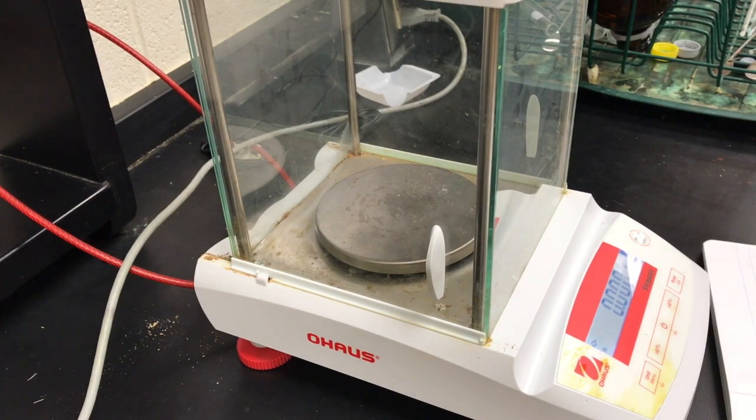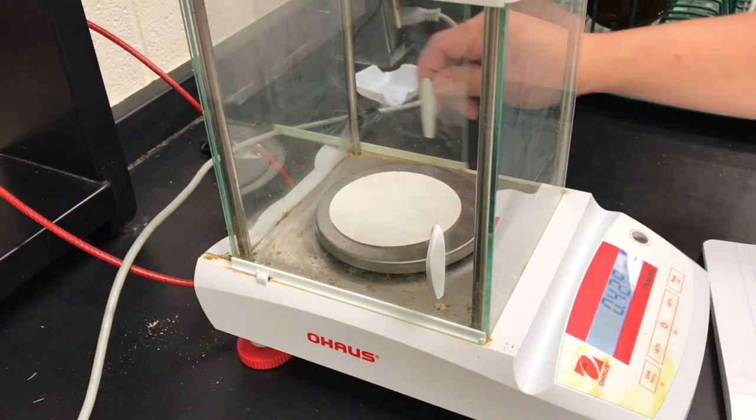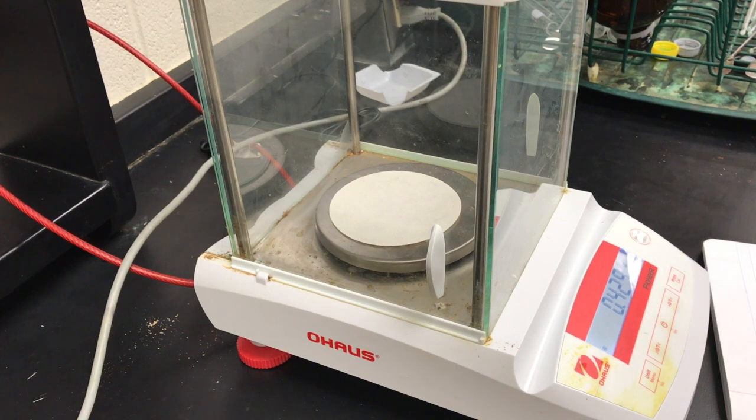We're going to need the mass of a piece of filter paper, so we're going to go ahead and mass it. It looks to be 0.427 grams. Scratch that, 0.429 grams.